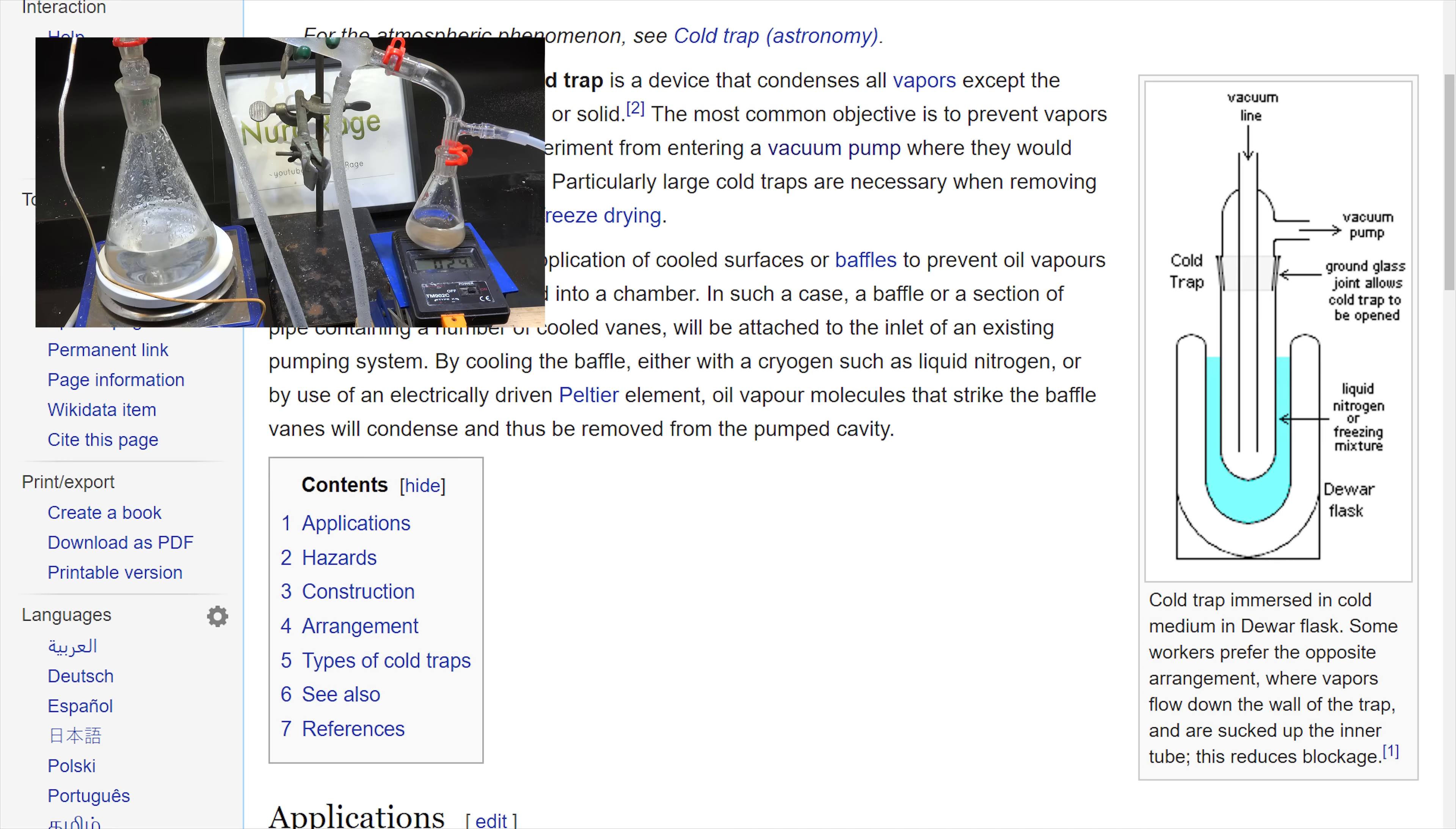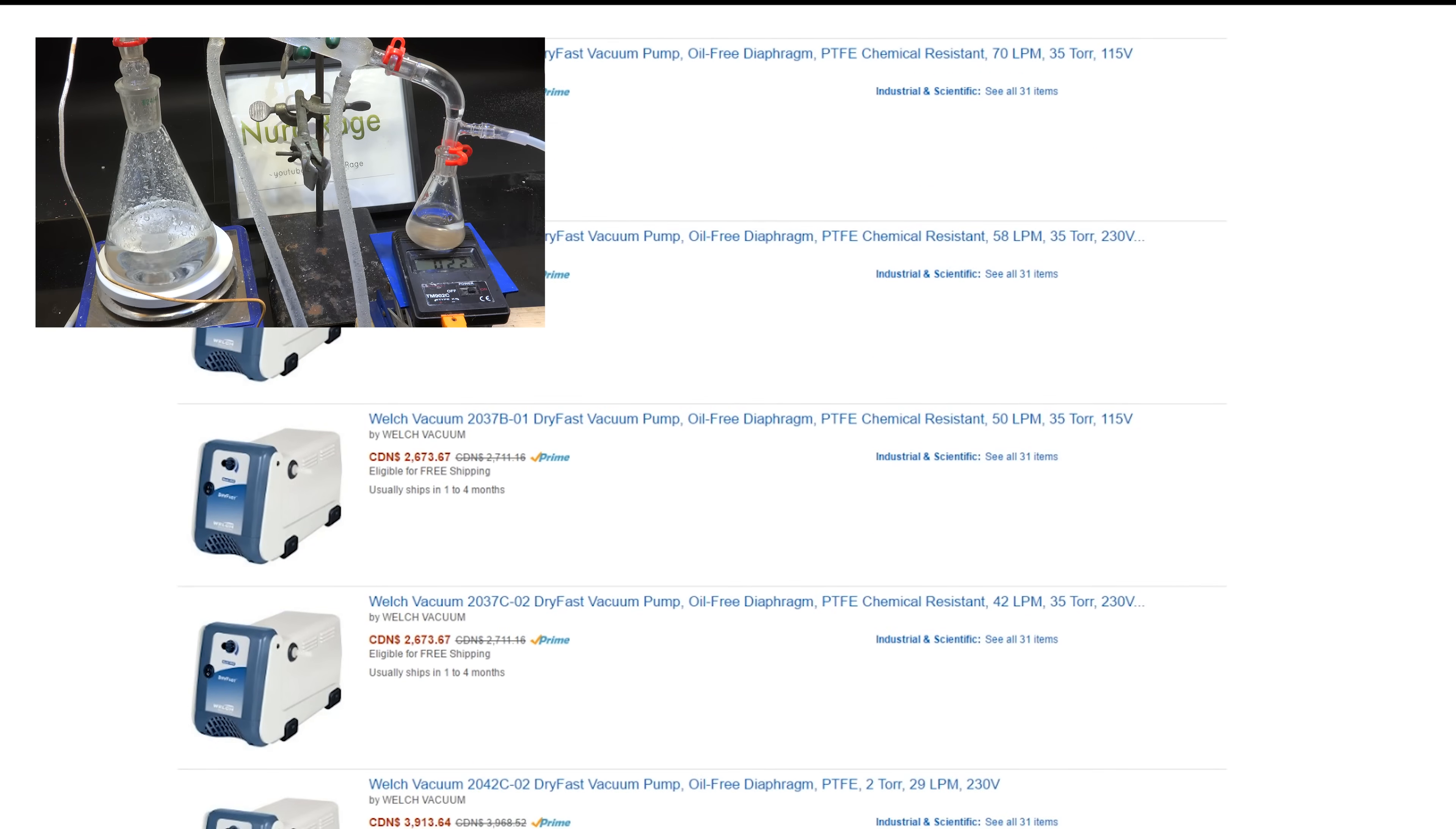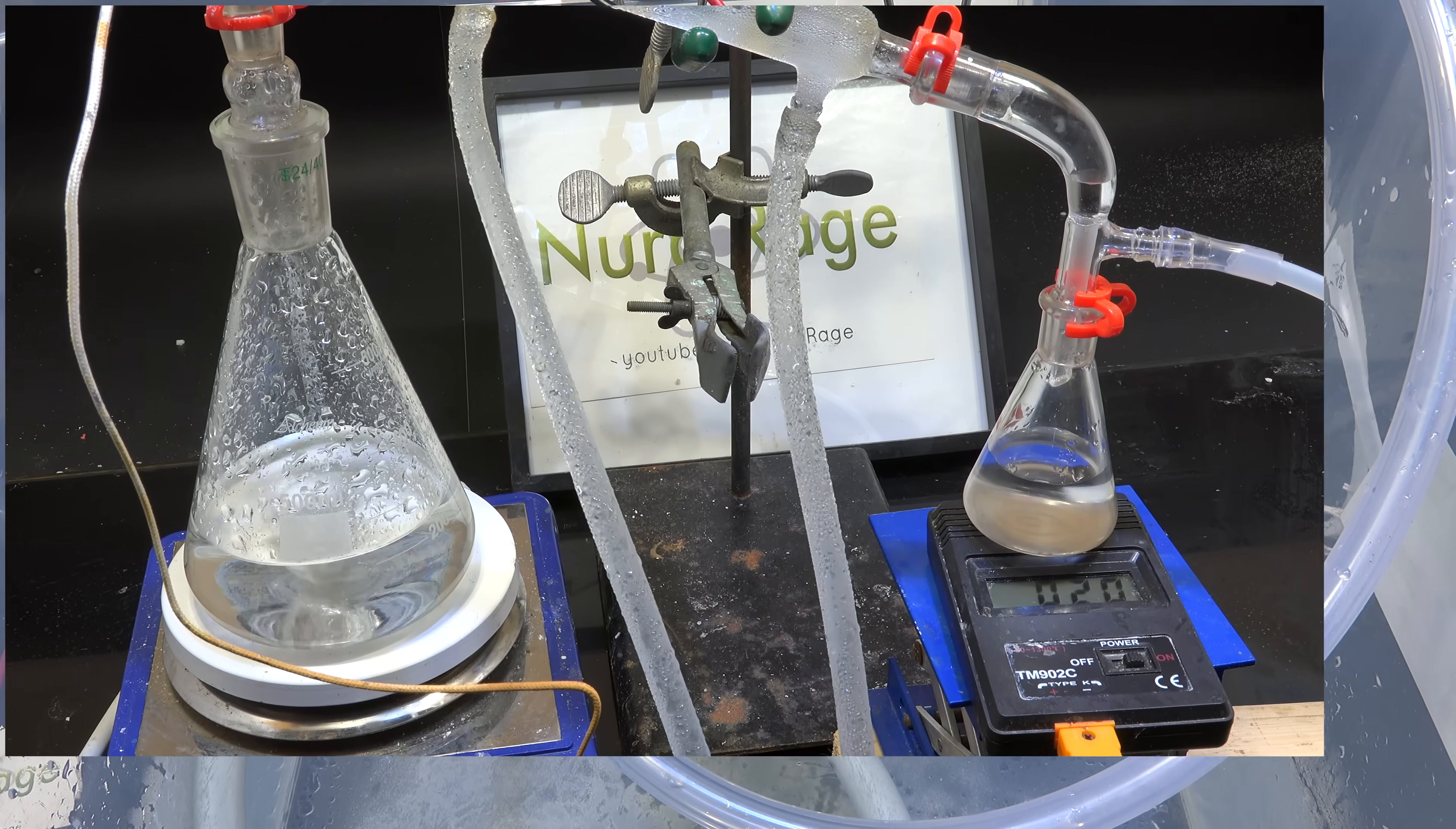Unfortunately the operating cost for such protection is often out of reach for the amateur. Another approach is to use a diaphragm pump with teflon or PTFE seals. These seals are chemically inert and thus a PTFE diaphragm pump can take corrosive gases and even pump liquids all the same. Unfortunately they are rather pricey. Overall an aspirator pump gives the greatest value if you don't need physics or engineering grade vacuum.